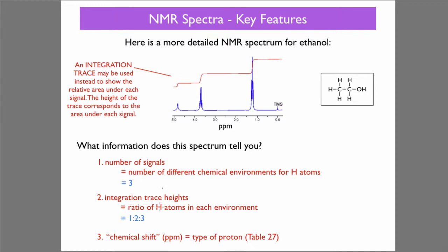And again, chemical shift tells us which types of protons they are. As you can see now, the larger the ppm, you can see this hydrogen bonded directly to the oxygen has a higher ppm than the CH2, which is because these hydrogens are nearer this hydroxyl group. And here, with the smaller ppm, these are further away from this hydroxyl group. But we'll get to that later.